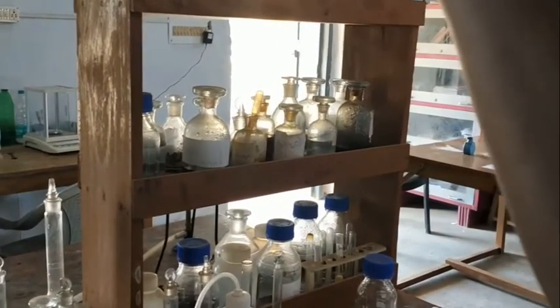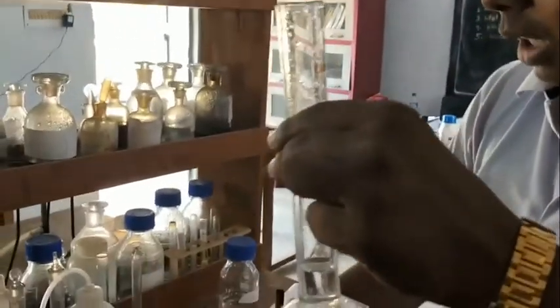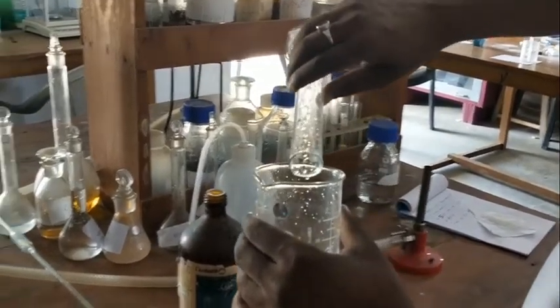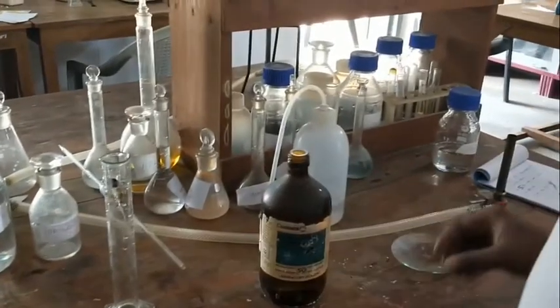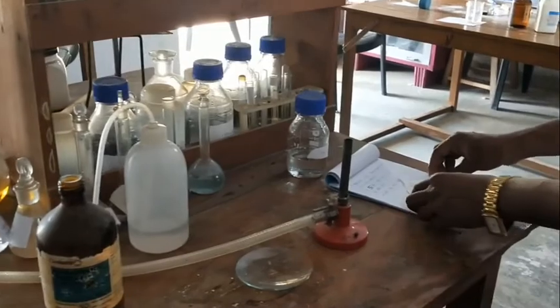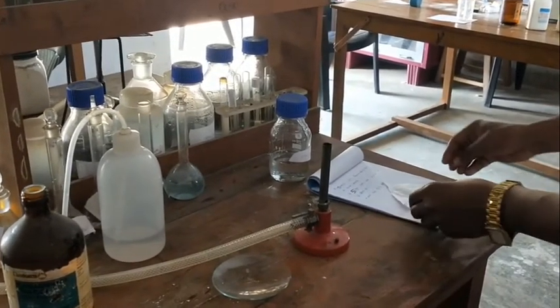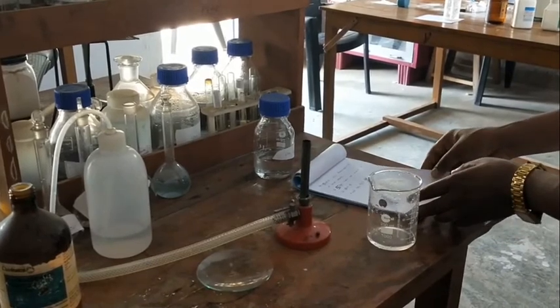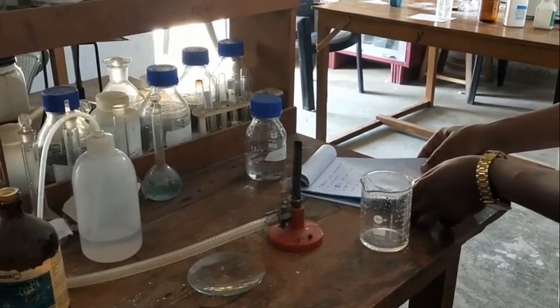I have measured 10 ml of formalin. Now this formaldehyde I transfer to a beaker. Then the already weighed 5 gram of urea is added into that beaker. Quantities can differ, it's not exactly according to our literature.